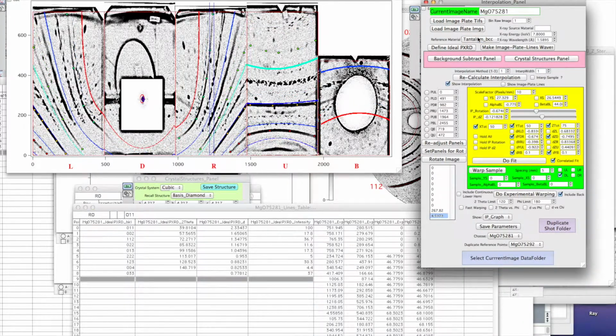But this is the most intense line for tantalum, right? Yeah. And if you see scattering from these... It doesn't seem right though. Oh no, that's not tantalum. All right, that's right. Okay. Oh, this one's not tantalum. No, yeah. So that's why.